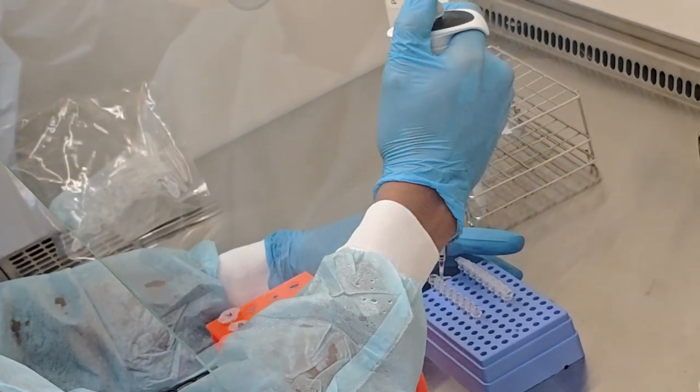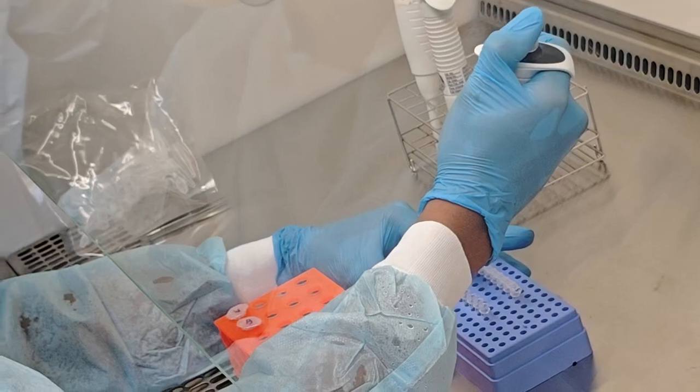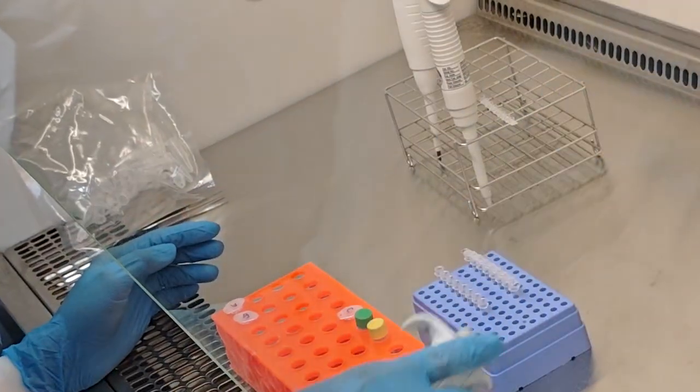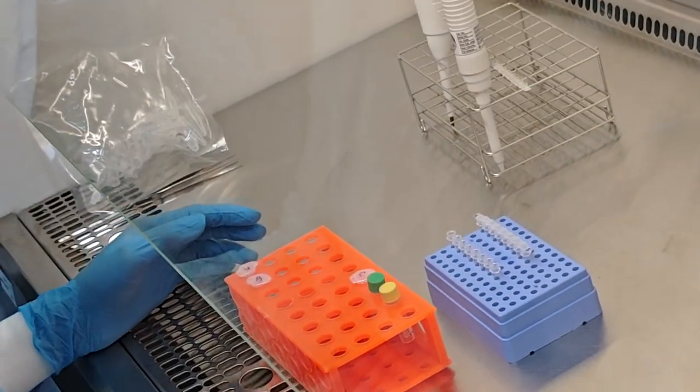Every time check whether your template is in your tip or not. Because the water is running it, so maybe you are not getting the template that you thought you had.